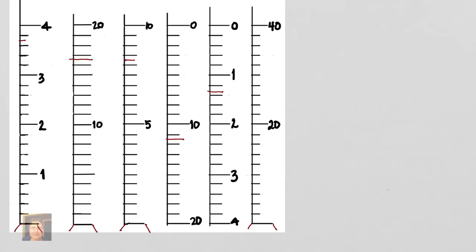We're going to look at a systematic method of making reproducible measurements. And the first thing we need to recognize is that measurements are not exact. There's always a small amount of error associated with them, but they should be fairly similar measurements if we're using the same equipment and the same sample. So the way that we get similarity or precision in our measurements is to follow a very precise technique.